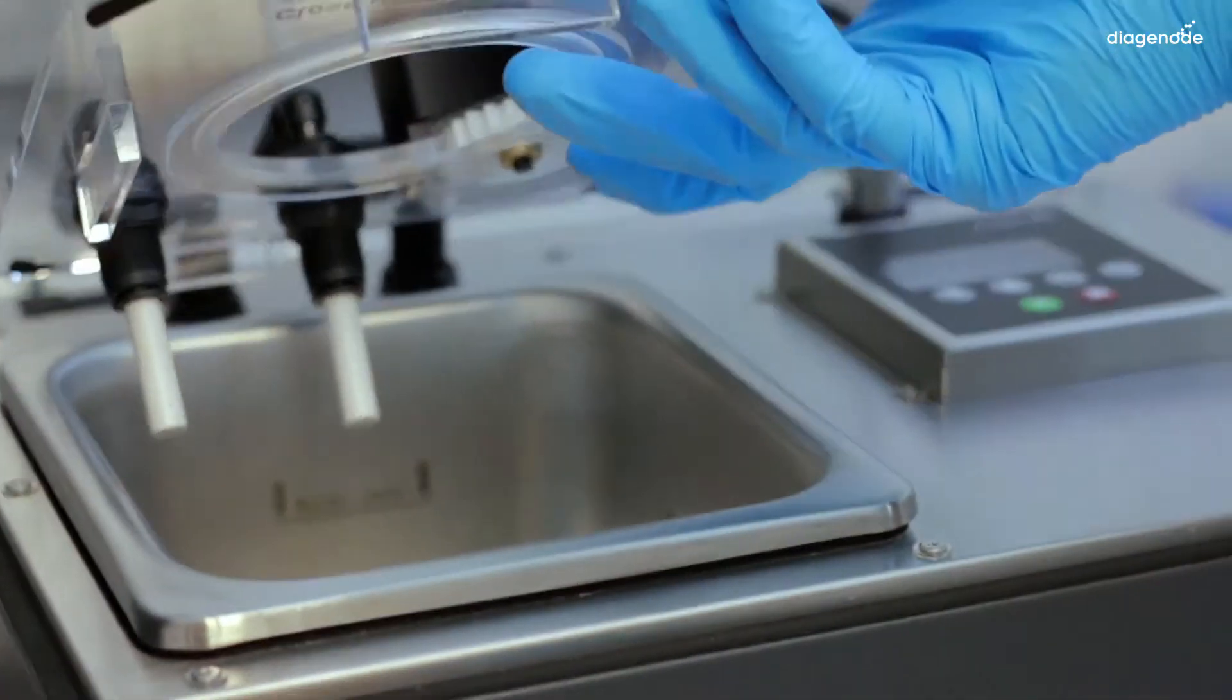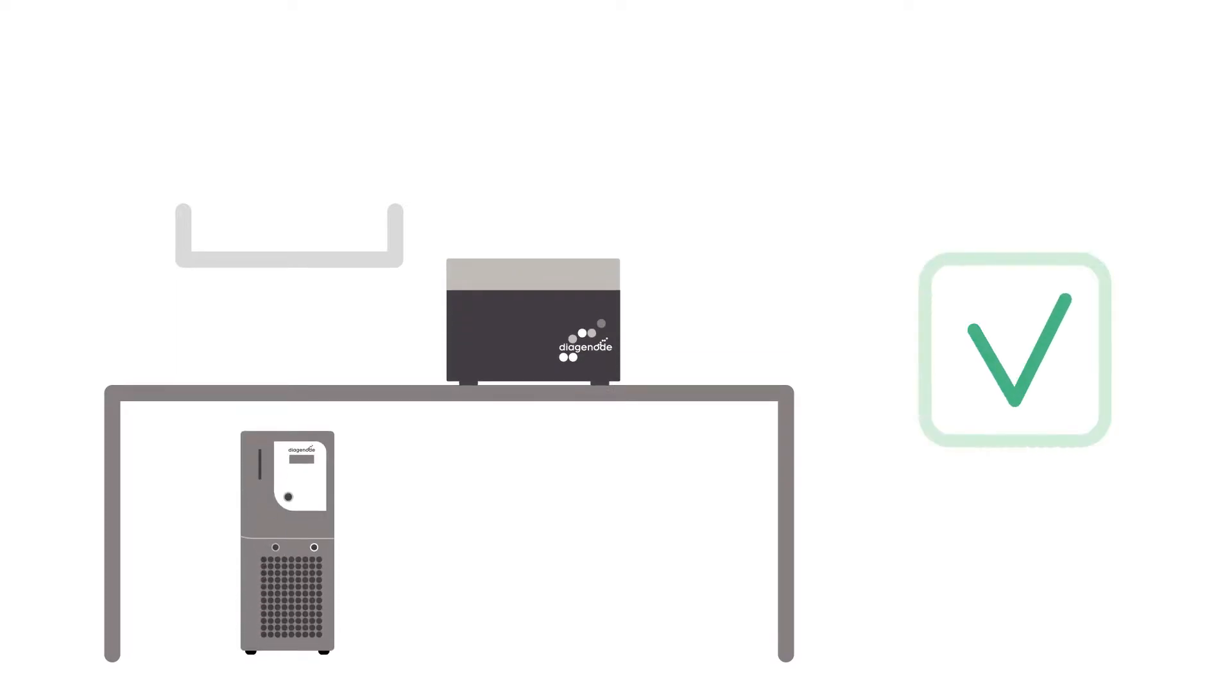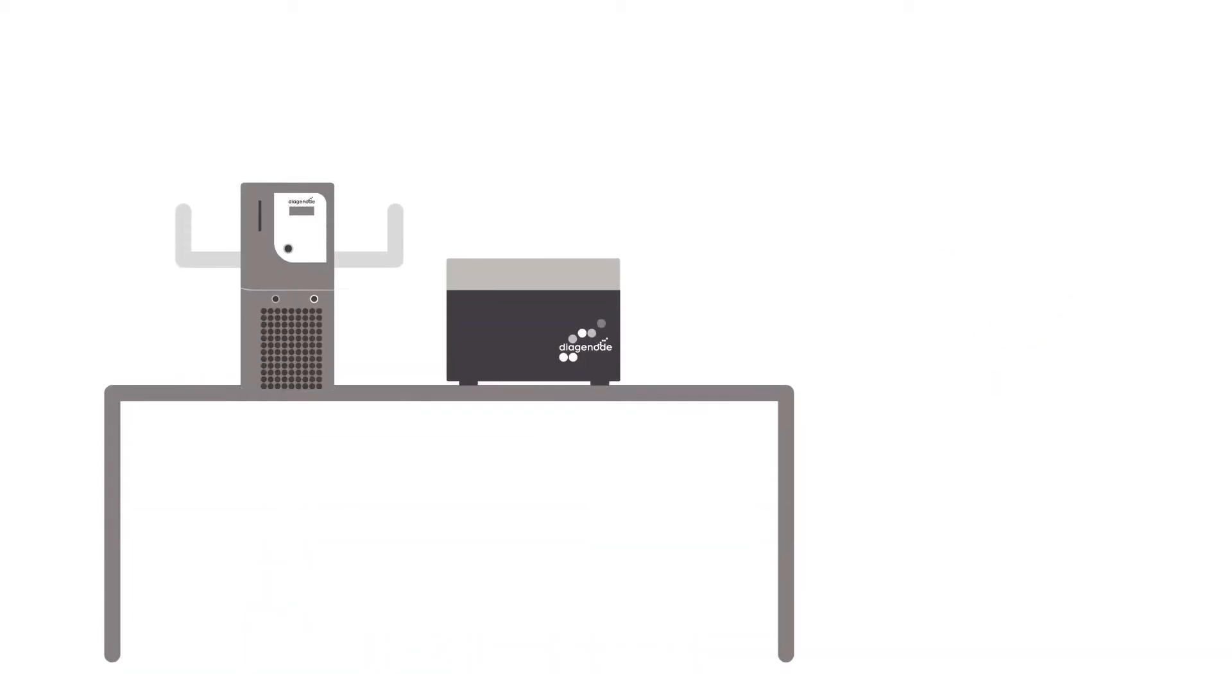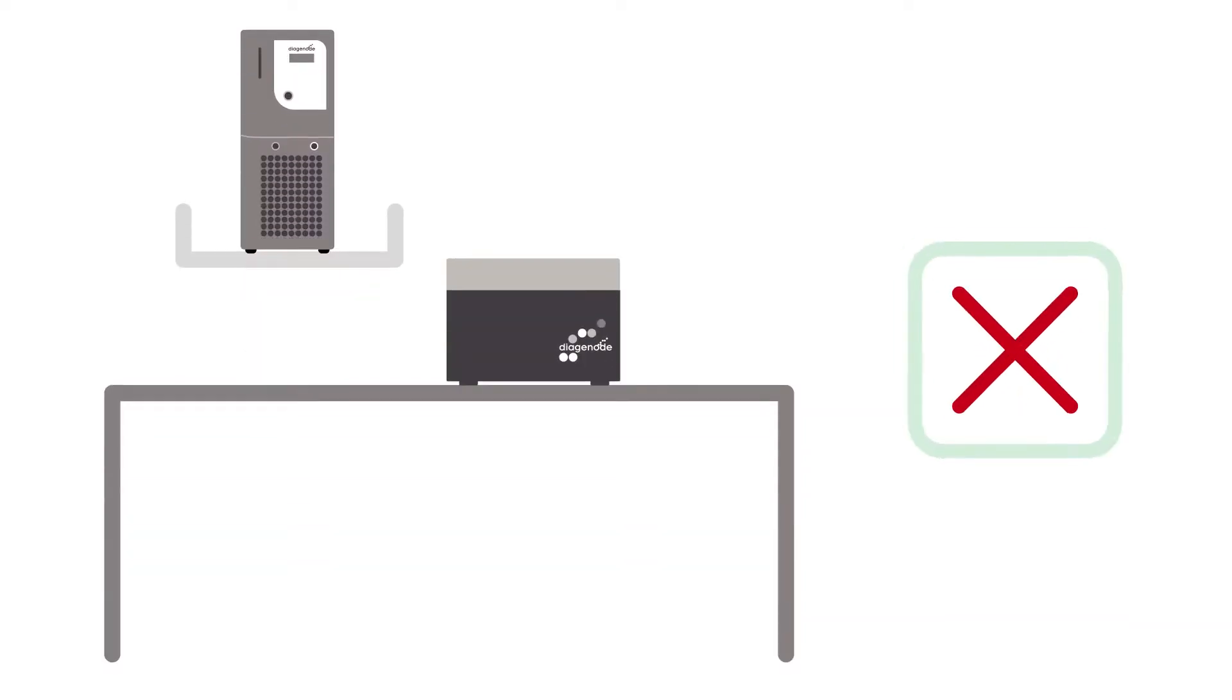Place the BioRuptor on a bench or another level surface, and place the cooler below the BioRuptor. You can place this chiller at the same level of the BioRuptor because it contains a special valve system which avoids overflow. But never place it higher than your BioRuptor.